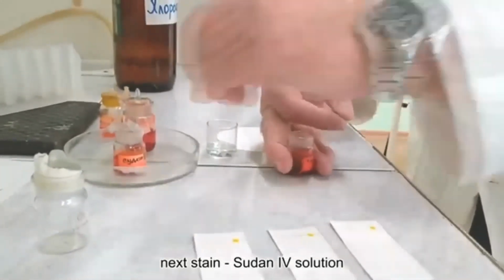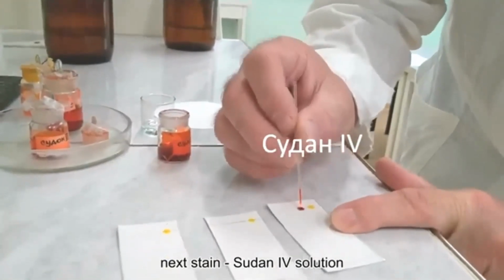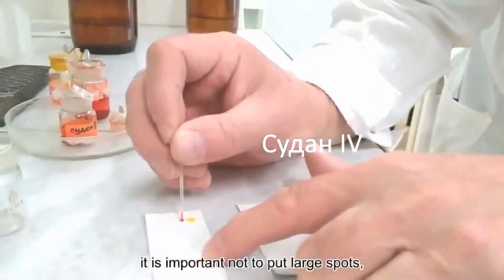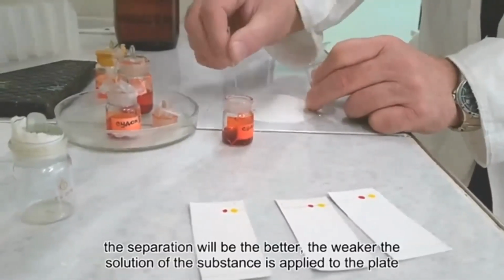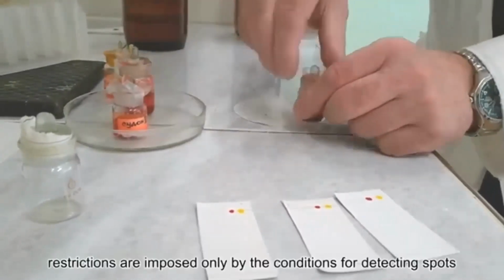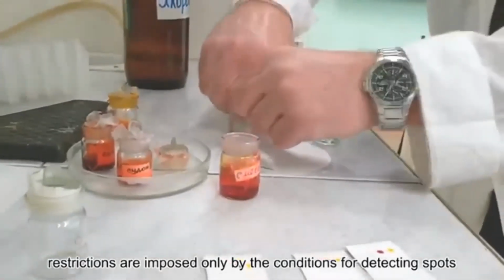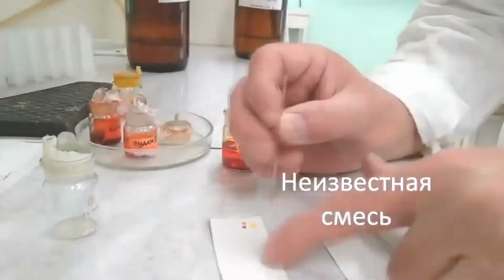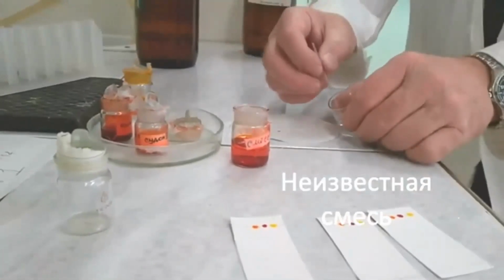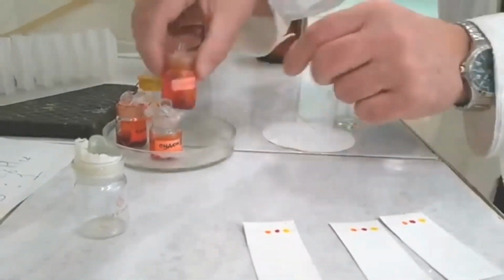Так, следующее пятно у нас Судан 4. Быстро набрал Судан 4 и уверенным движением, не перегружая. Вот эта небольшая перегрузочка, концентрация хорошая. И промываю капилляр. Так, сюда. Дальше идет смесь. Смесь, вот она. Так. Упс. Есть. Моем от смеси. Так, смесь закрываем. И остался Судан 3.